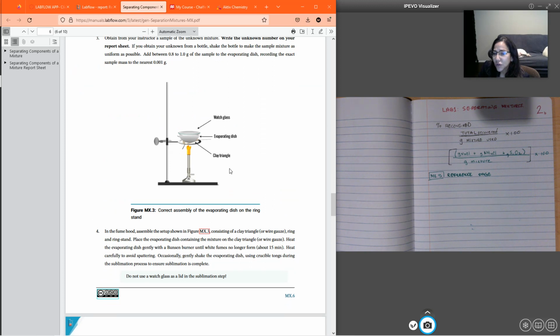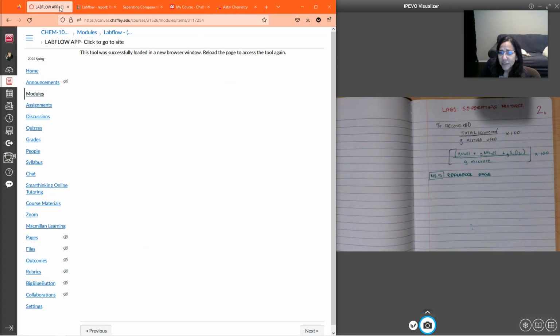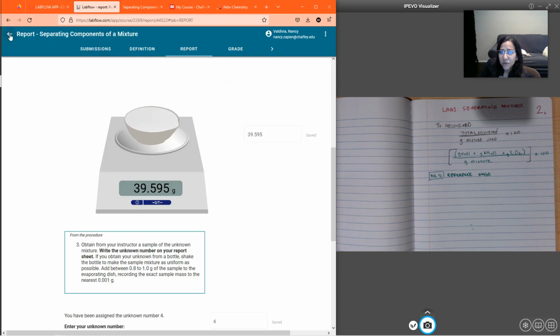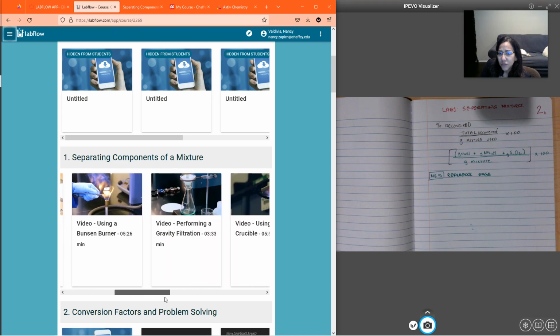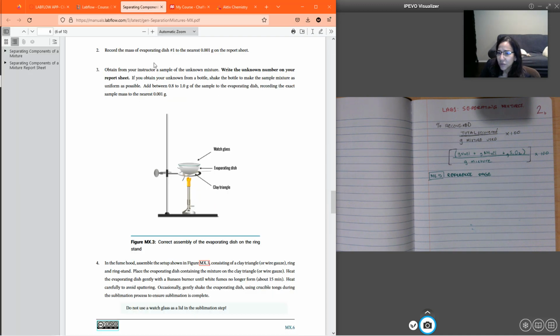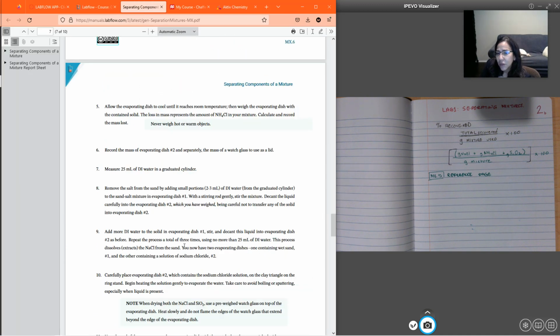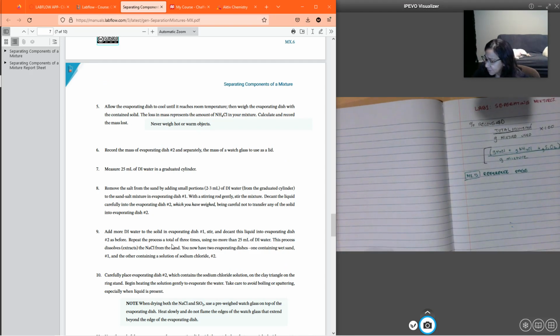All right, so this one is going to go through your little process right here where you're going to start heating up your mixture. And this is actually in a nice little video on how to do that. You've seen a crucible. So how do you use a crucible? Basically, we're drying out our mixture. It wants you to record everything. Make sure you record your notes on your lab, right?